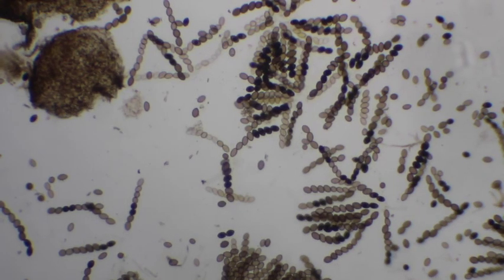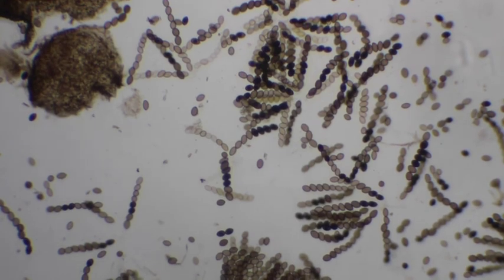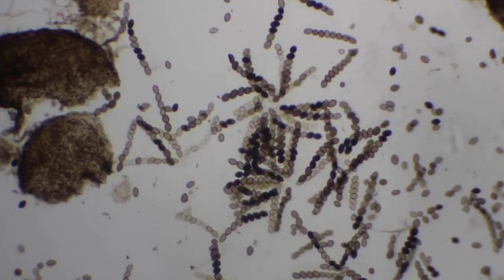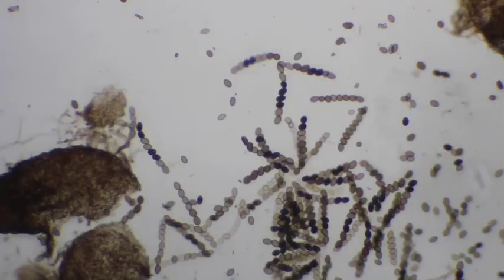Another nice one there, and you can see with this scope, once you figure out what you're looking for, we don't have to zoom in on higher magnification every time. We know exactly what we're looking for. We can go a lot faster under lower magnification rather than higher magnification.